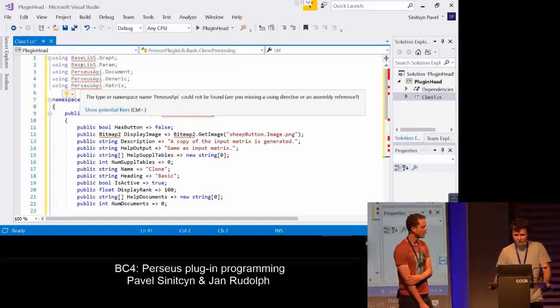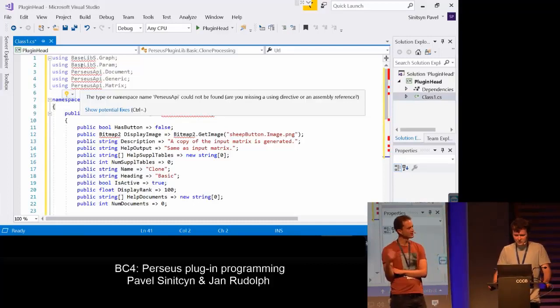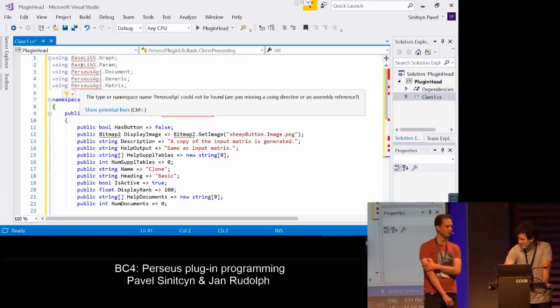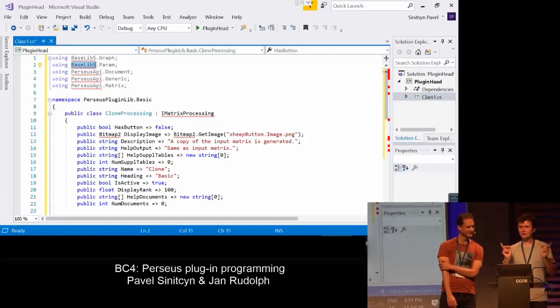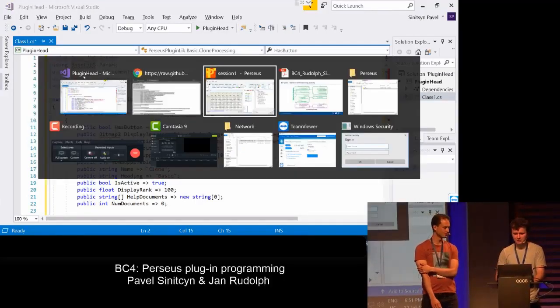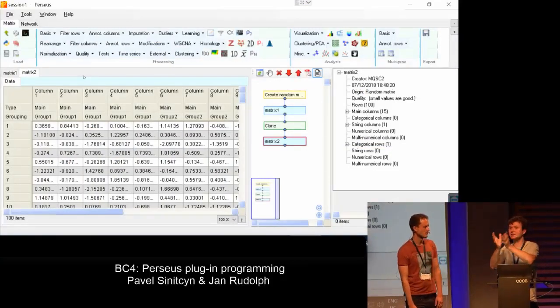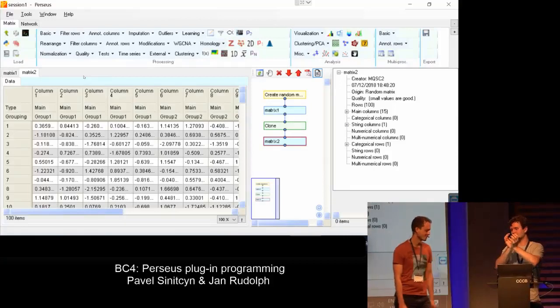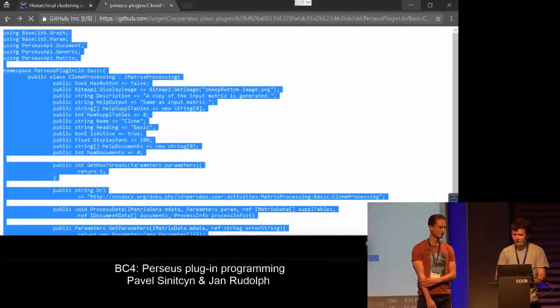Maybe we have to tell our plugin where it can find these Baselib S and Perseus API. What's this Baselib S? We never talked about Baselib S. I don't care, let's see if we can find it. The question is how can we do it. Perseus API is a library which contains some part of the code. It's exactly the declaration created by Perseus which any plugin should satisfy. So where can we find it?